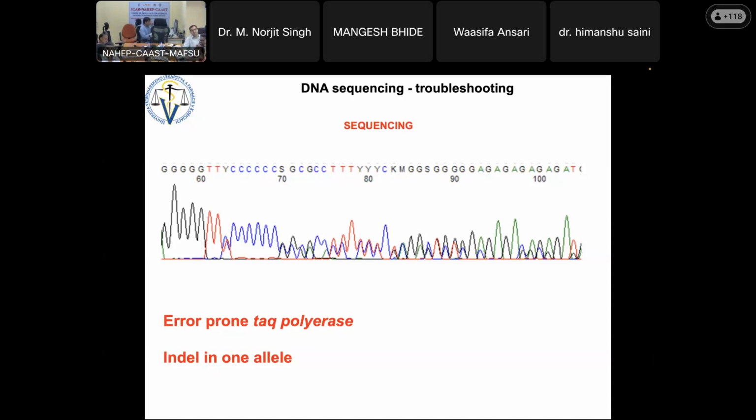And if you have 400 base pairs, how much will be the error? So there is no error actually when we are talking about 1000 base pairs. So don't worry about Taq polymerases. The company can insist you use PFU, but you don't need to spend money on that.